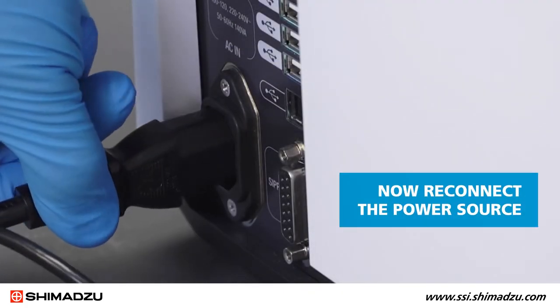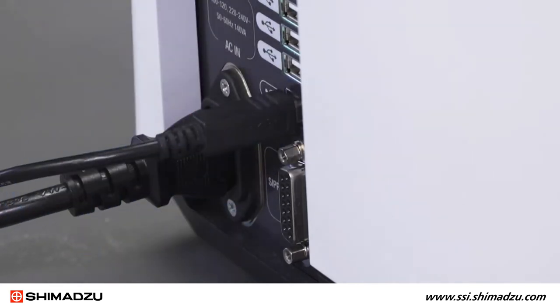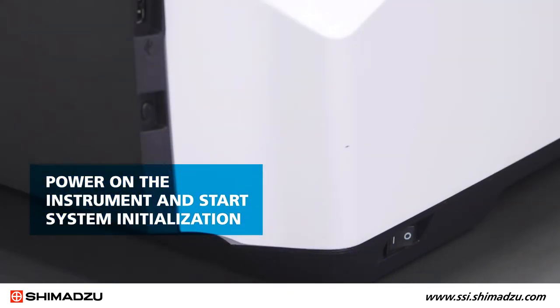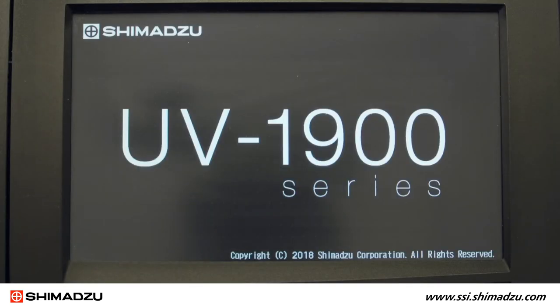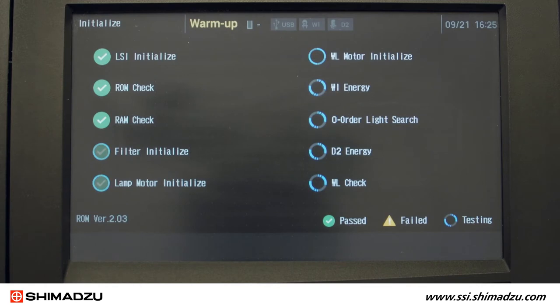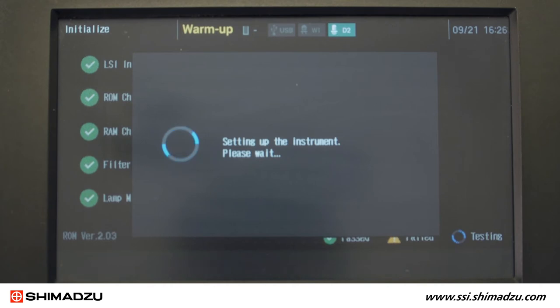Now you reconnect the power source, power on the instrument, and start system initialization. The UV-1900i is equipped with an LCD screen that shows the initialization steps. You can ensure that the new lamps were properly installed by confirming the instrument passes the D2 Energy Check and WI Energy Check stages of initialization.